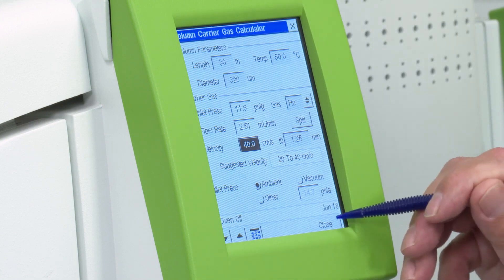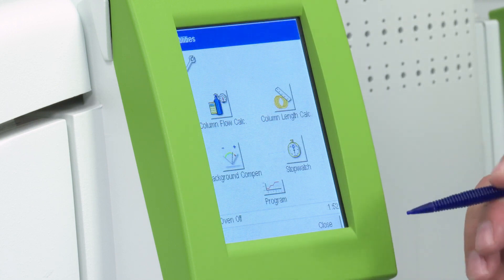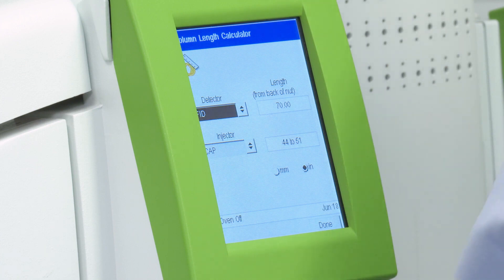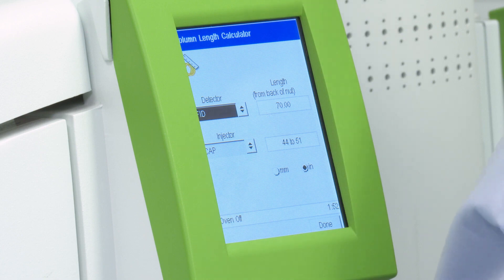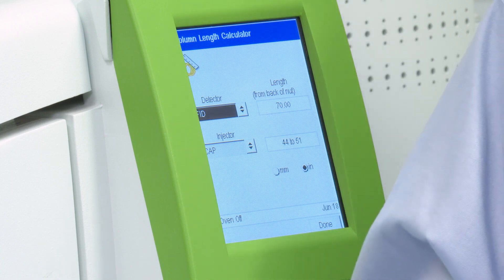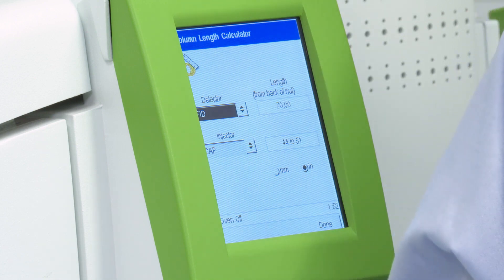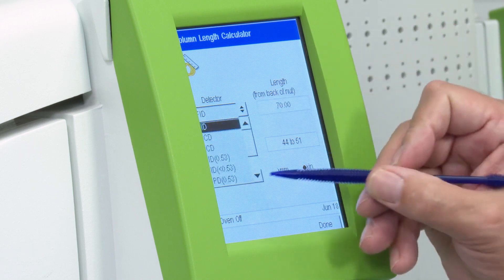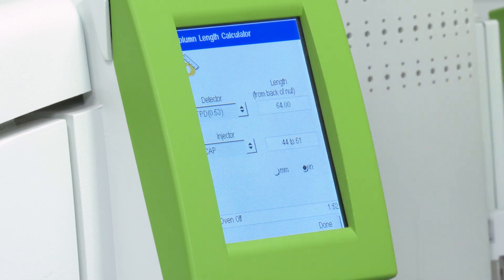There are some other utilities in there as well. One's called a column length calculator, and this is just a quick reference to the insertion depth for the various detectors and injector inlets that we have on the GC. So we can do it for an FID or any of the other detectors we happen to support.